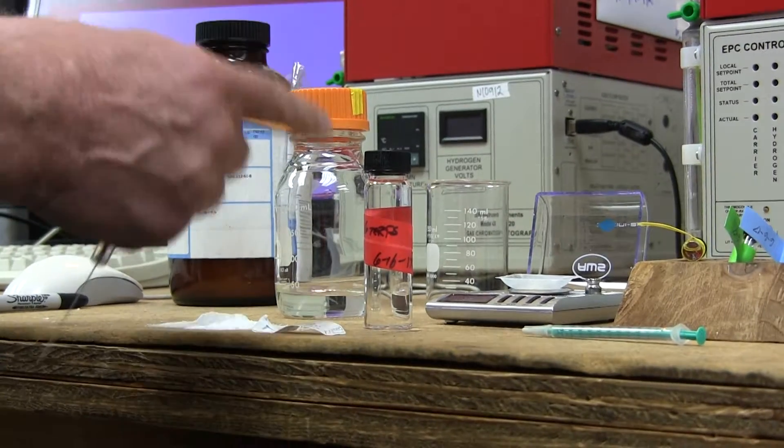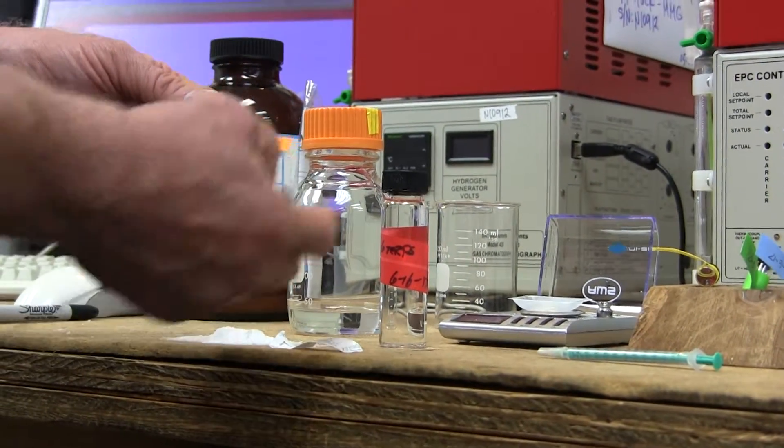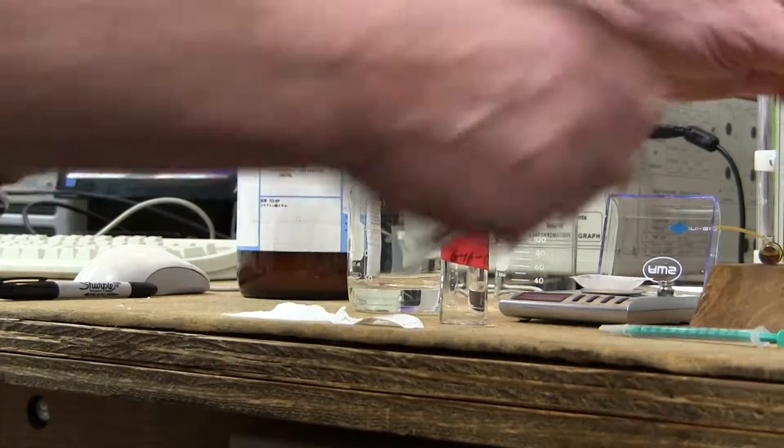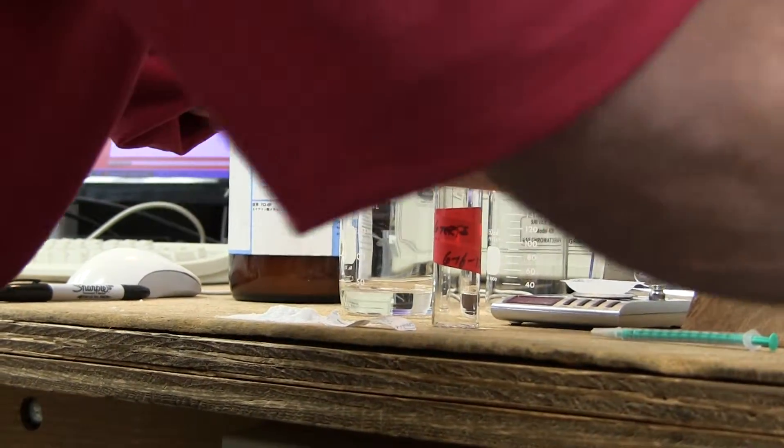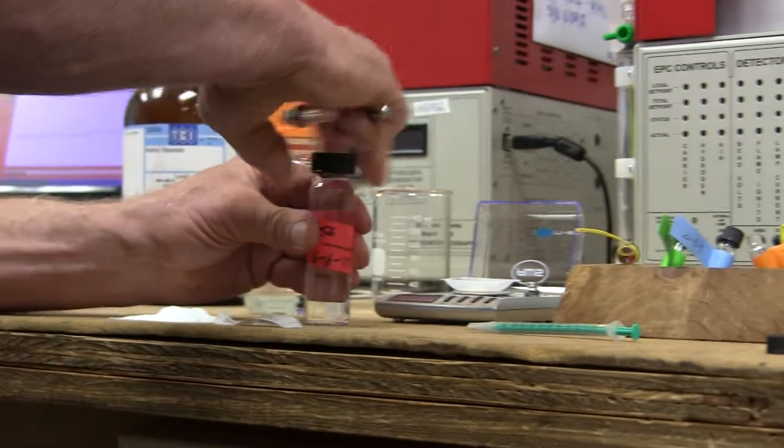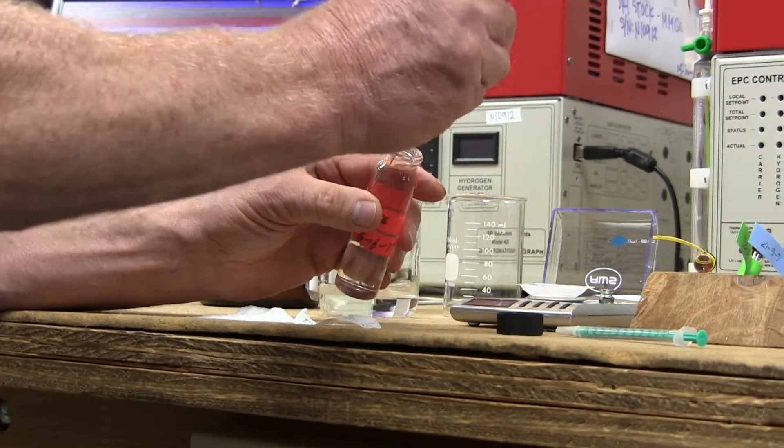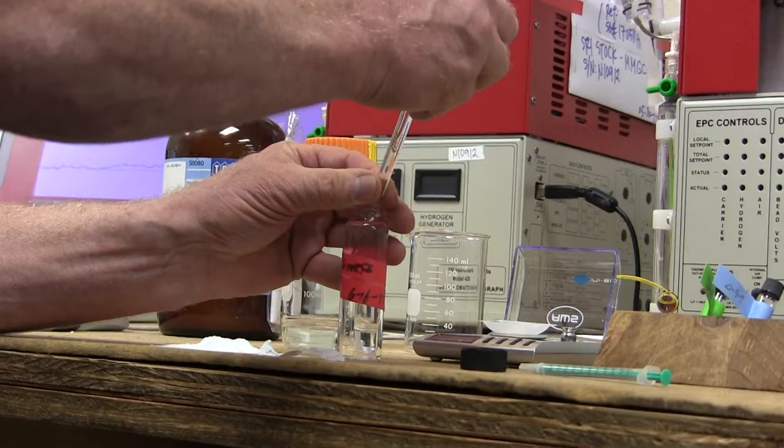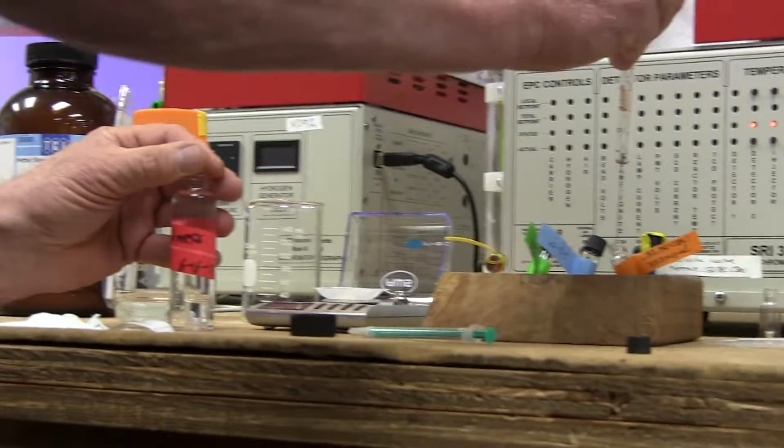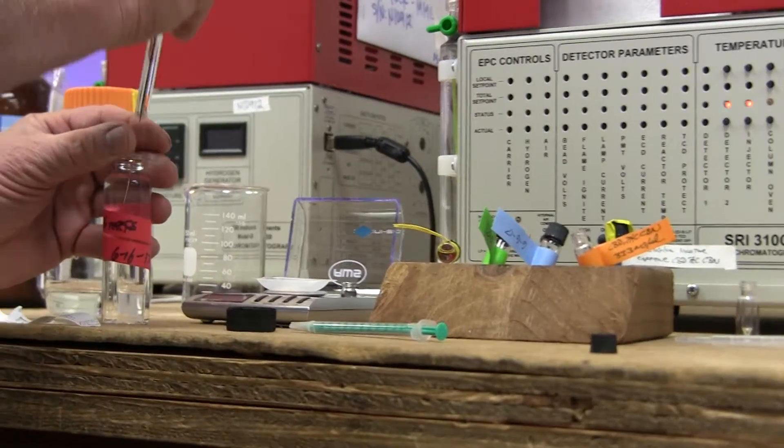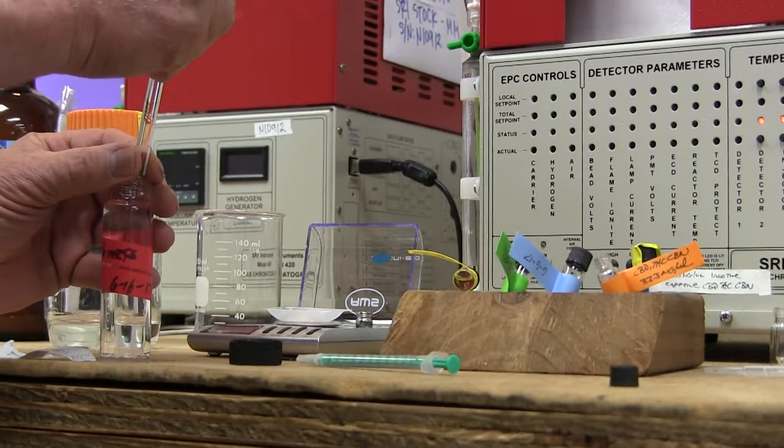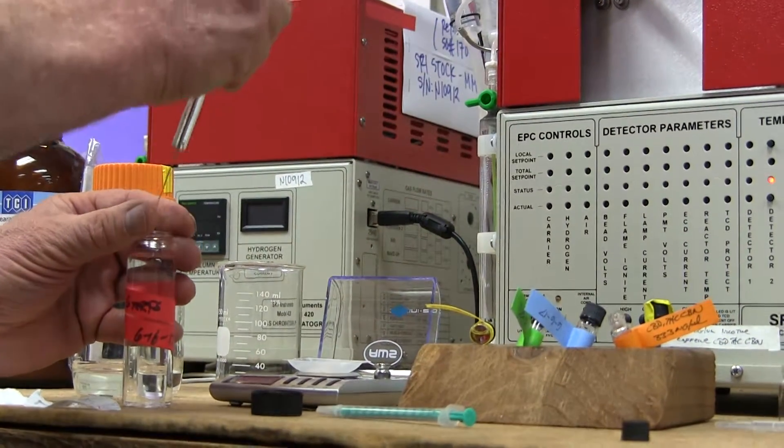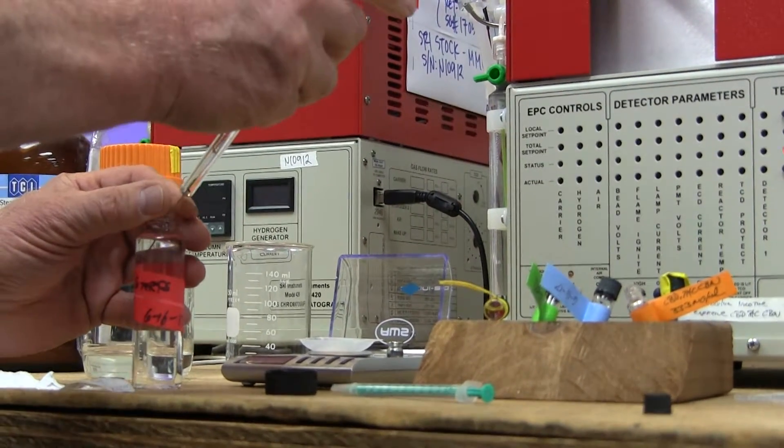That way, we can have one calibration standard that not only includes the three cannabinoids, but also includes the six terpenes that we chose to put into this bottle. So we'll go back with our 100 microliter syringe and take 300 microliters of this. It's only a 100 microliter syringe, so I'm going to have to do this three times. Here's the first 100 microliters into the bottle, then the second 100 microliters, and then the third.